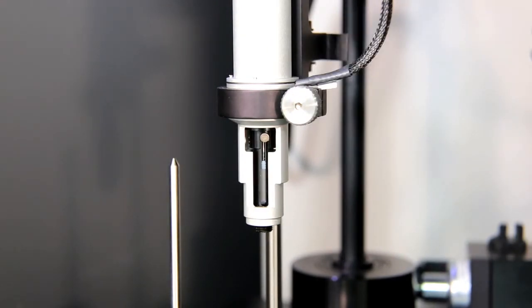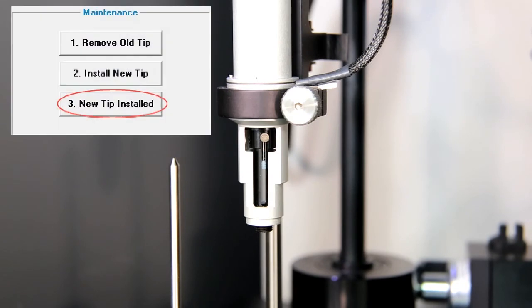The last step before reinstalling the syringe is to click the New Tip Install button in the ITC200 software.